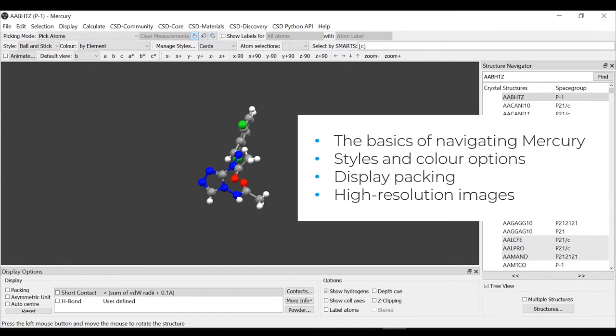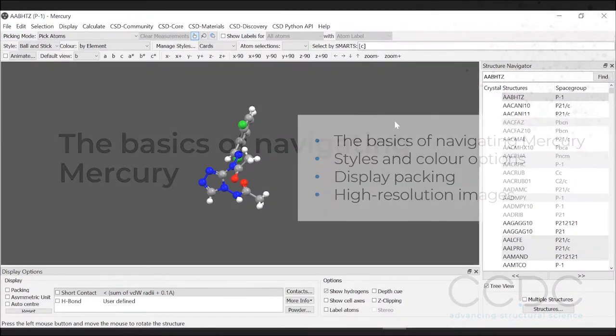We're going to see some of the features that Susanna has illustrated in the presentation and we will create an image together.